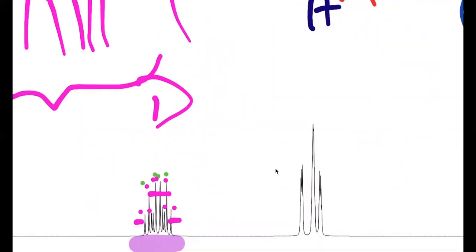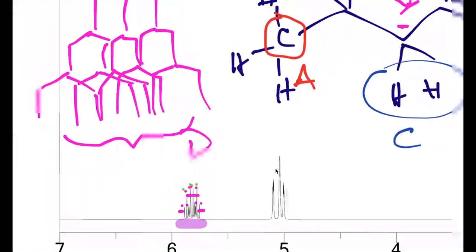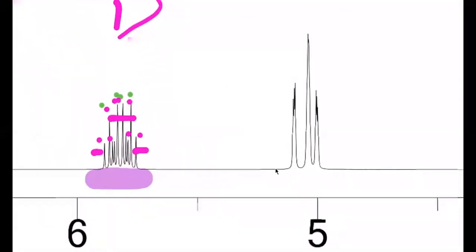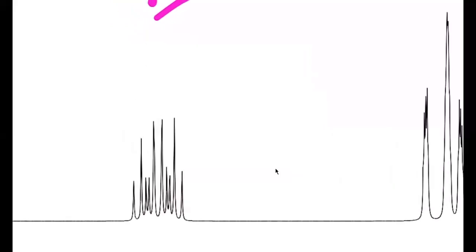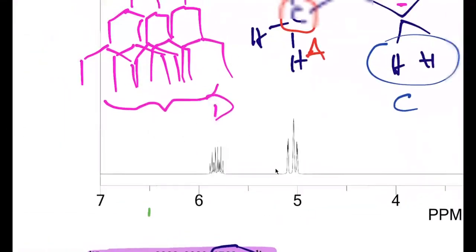Okay, so when you do splitting, how did you get 10? Because at first I thought you just count the lines, but then I counted more than 10. Not from the spectrum. I mean, when you do the splitting tree? Yes. Right. So the point is, with the splitting tree, there may be some overlap between, say, right here, right?